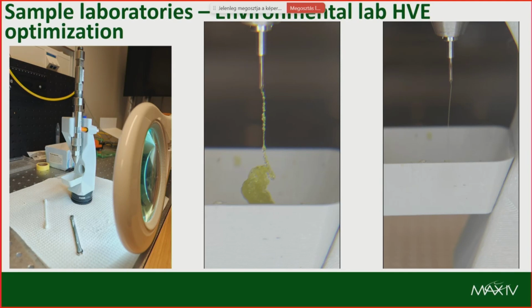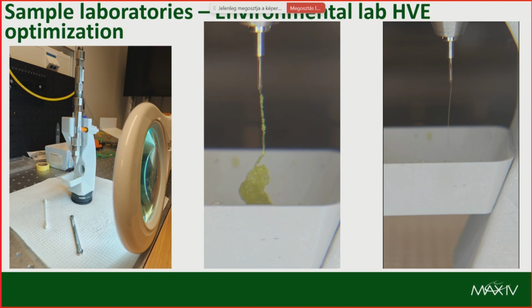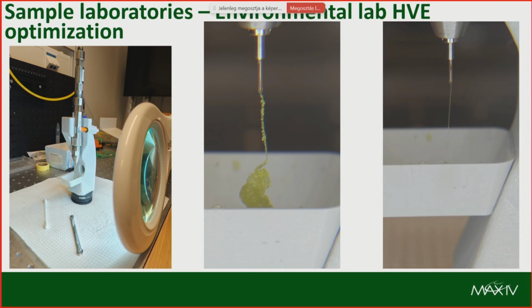This is why we also have an offline setup for testing. This is something we did a few weeks ago for users that are coming in 2 weeks, and that is to optimize how the stream is going. So the first video is what we don't want the stream to look like. This is curling, and this is absolutely horrible to collect. And that's why it's necessary that we can optimize how the stream is going to be before you come and collect, because this is how you actually want it to look.